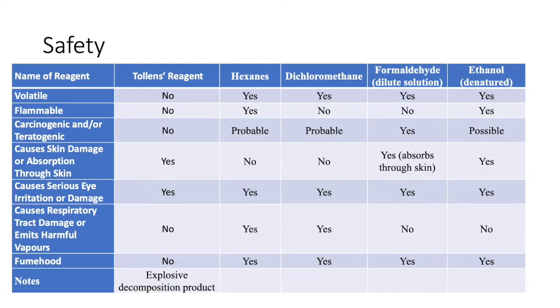In this experiment, we'll be using a number of different chemicals. Some of them are test reagents, and some of them are positive or negative standards. We'll also be using a number of unknown samples, but those will just be diluted versions of the standards.